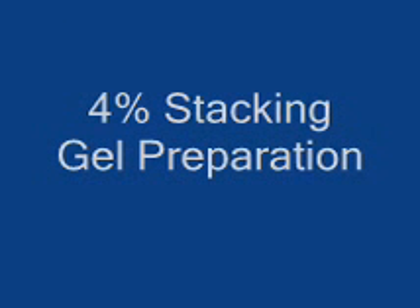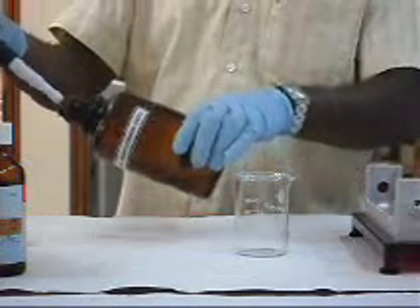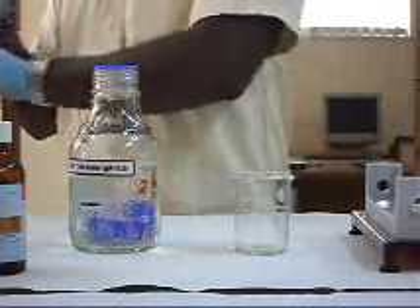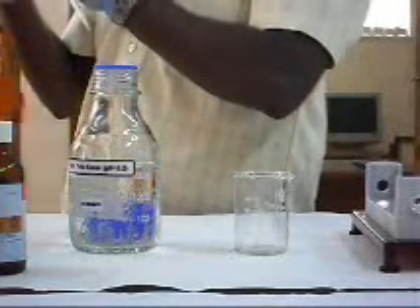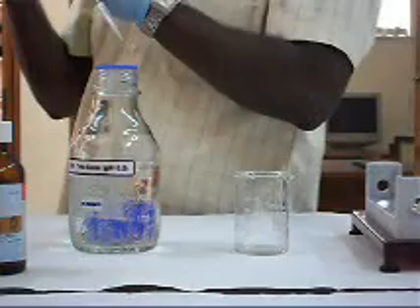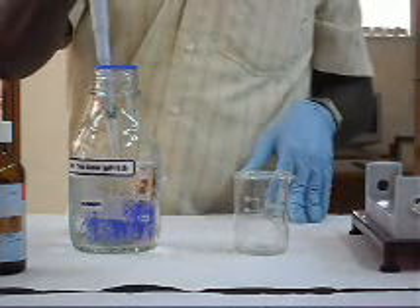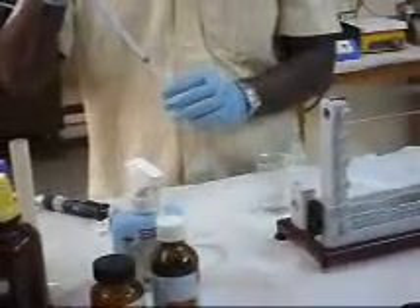For 4% stacking gel preparation: 2.66 ml of 30% acrylamide-bisacrylamide solution is added, along with 5 ml of Tris-HCl at pH 6.8, and 12 ml of sterile water. Then 150 µL of TEMED, 10% APS 250 µL, and 10% SDS 25 µL are added.